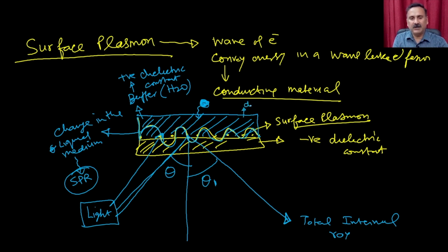If you make the media denser, this is going to give you multiple rays, but at a particular angle there will be a complete absorption of the light, and at that particular angle you will see no light. You will not see any of the reflected light.